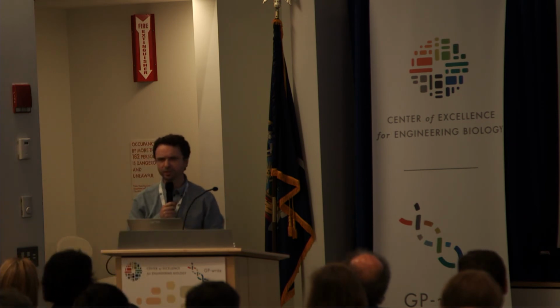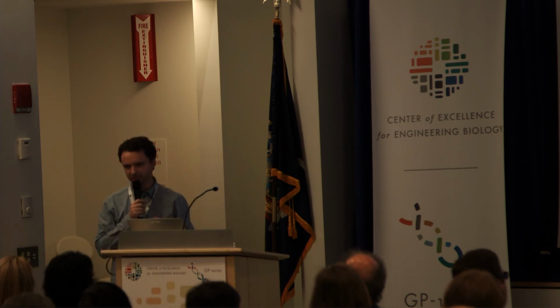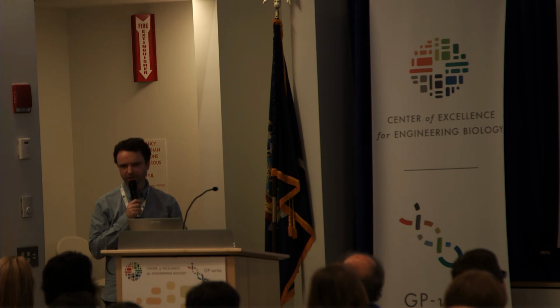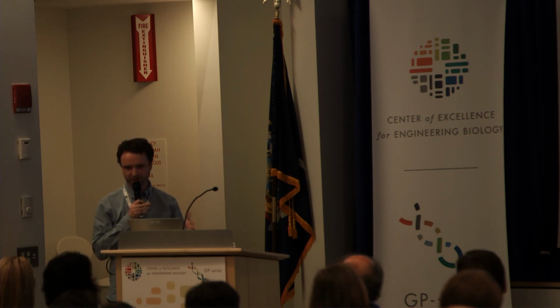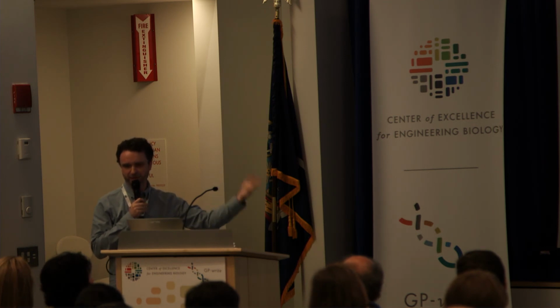So we can do about 1,000 organisms a day. So that's running through around about 15,000 transfers and about 14 plates. So the other advantage of having the different work cells is that we can batch process things. We don't need to go to the end of execution. So we can get a lot of scalability around saying, well, this process gets done to this point, and then these things are banked, and then the next day we can do the next section.